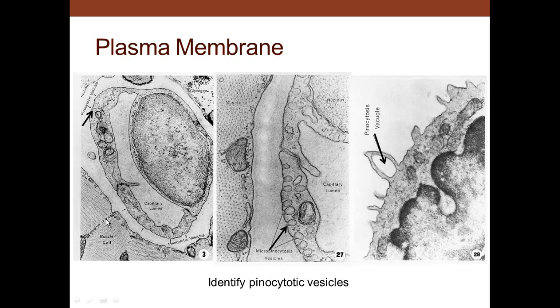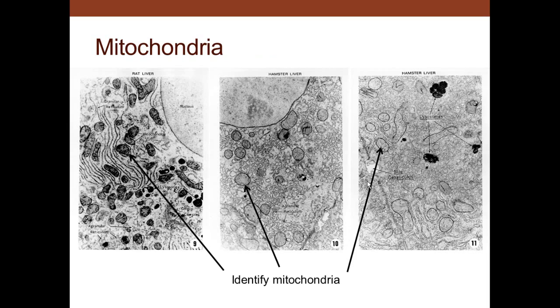This is muscle, and around muscle these are vesicles that are inside the muscle cell itself. And then this is endothelial cells. You can see where you have transport of things through the vesicles from the capillary lumen to the outside, as you see. And this is a pinocytotic vesicle, which usually is associated with tasting the environment.